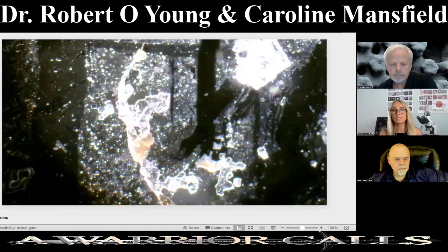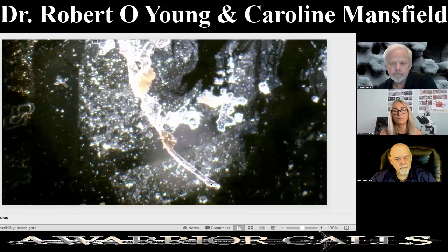And this was 3 days later. You can see everything's really dried up now, and there's crystals formed from the marine sea plasma all on it. It's almost like encrusted and encased, and it's just solid now. And this is the other end of it. So I just thought that was a very interesting experiment to see what would happen to one of these structures under the microscope, and just left it for a few days.